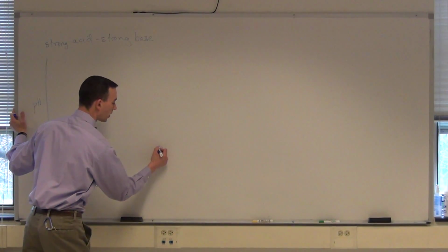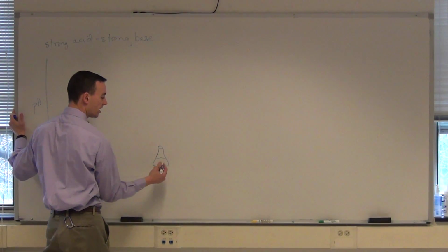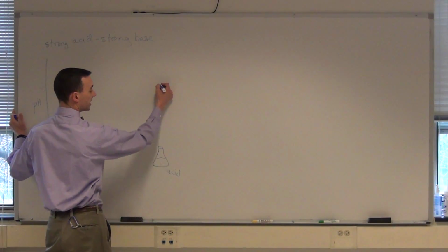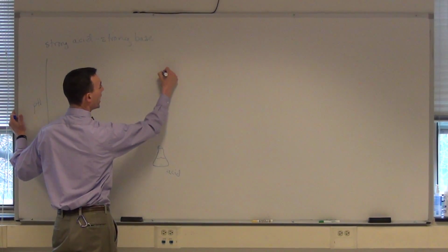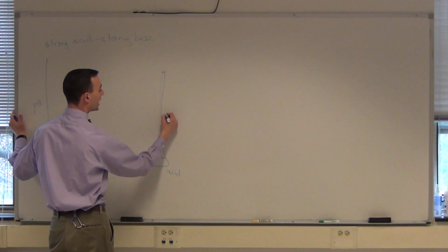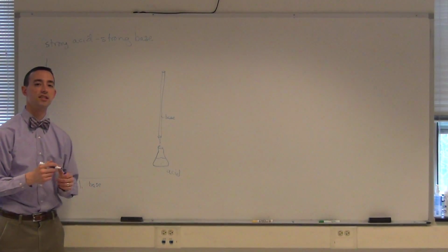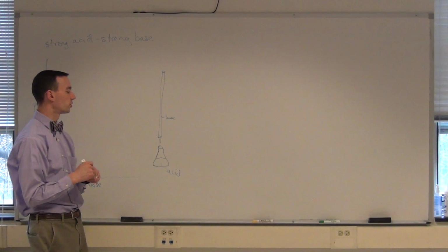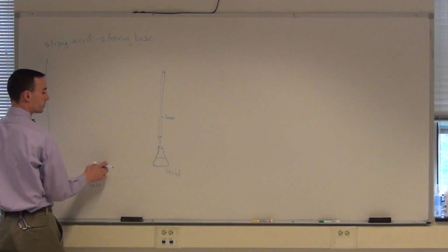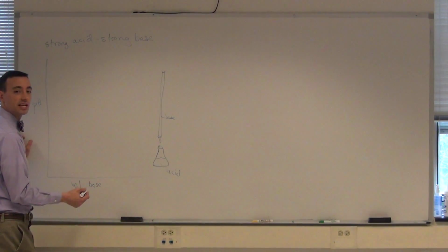We would have our reaction flask, usually an Erlenmeyer flask, and you would begin with your acid in this flask, and then you would most likely use a burette to add your base. This is the same way that you conducted titrations in Chemistry 1, I'm sure, here at York. Now we would just do this a little bit differently in that we're going to measure the pH each time we add some base into the acid.